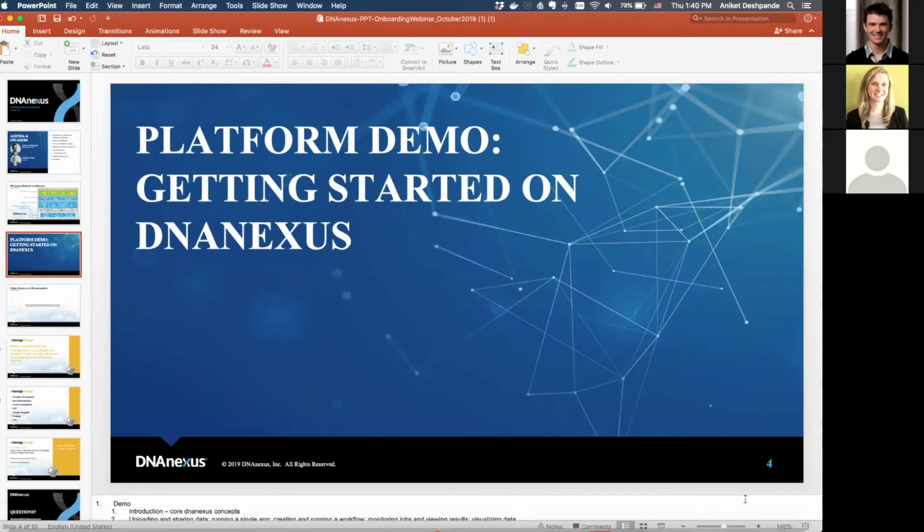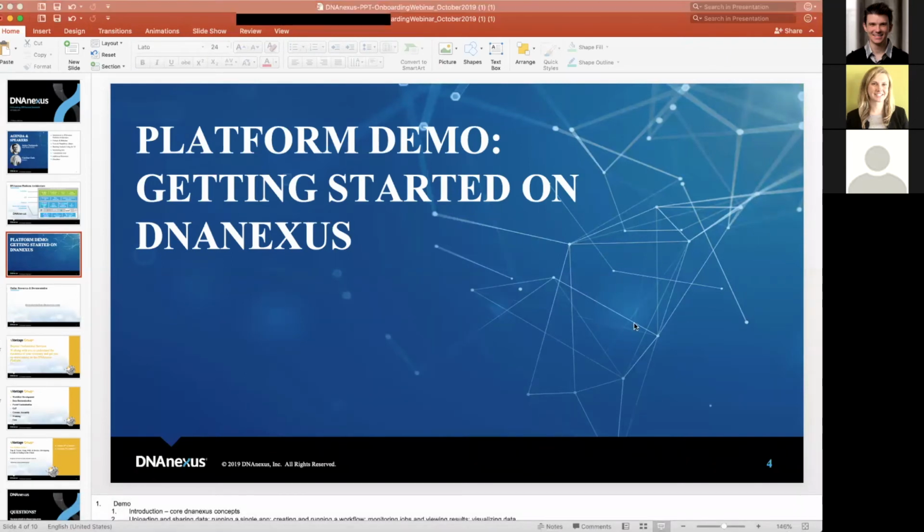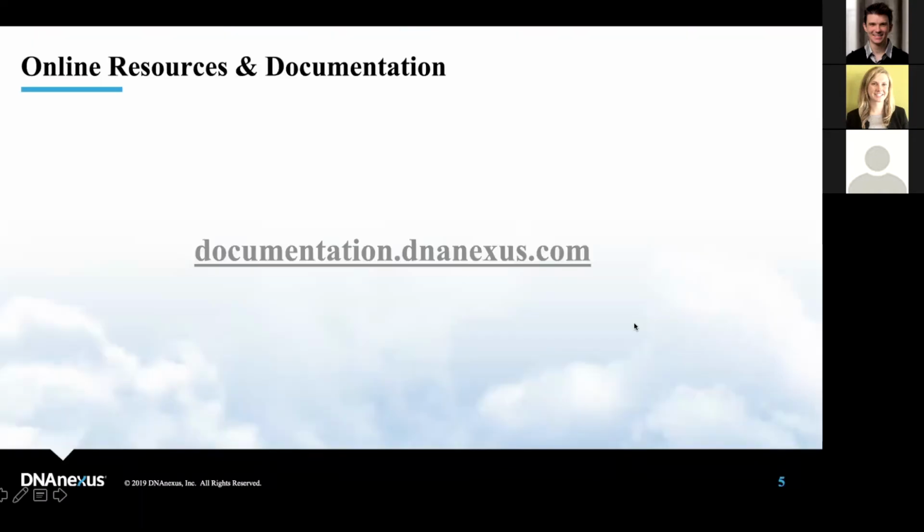PowerPoint right here. Quick mention about documentation as well. For users who would like to try out and give the platform a go, we also have online documentation, which covers what we covered in the webinar so far, as well as a lot of additional documentation on the CLI and the SDK.